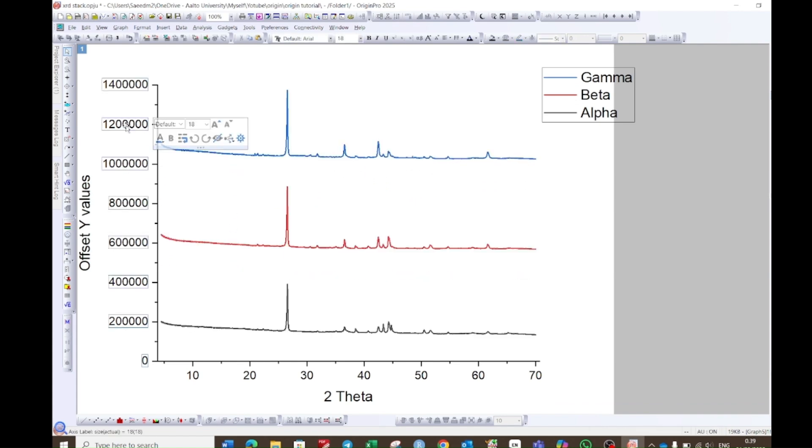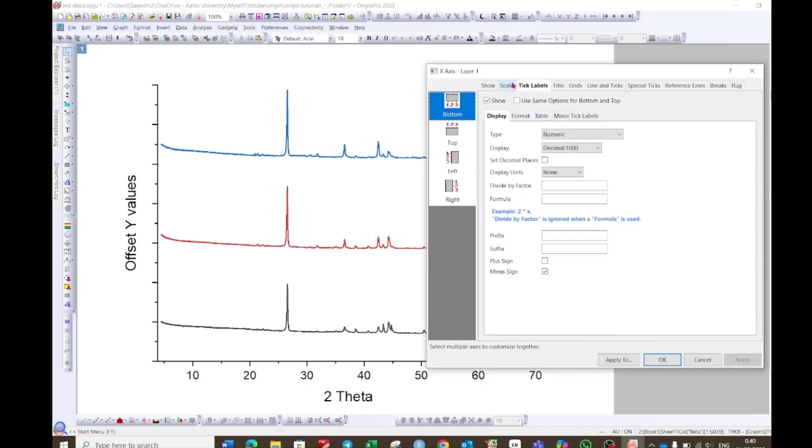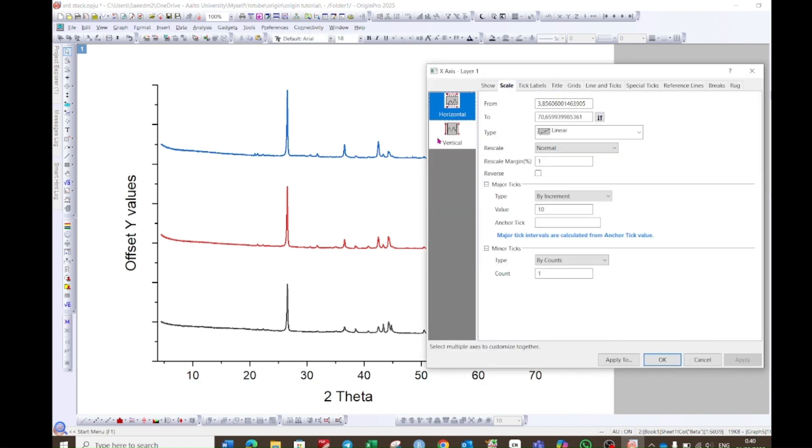Now select this y-axis, hit the delete button from the keyboard. Now again select this x-axis. Go to the scale option. Choose vertical.